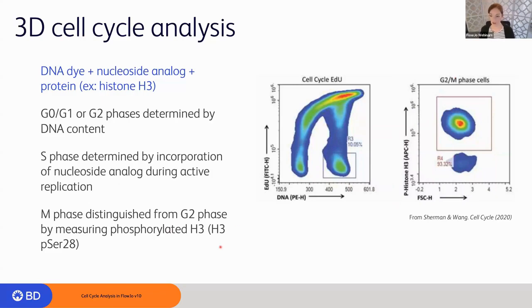So by including that third variable, we're able to decouple and be more discrete about identifying those different stages. And again, there can be variations on this assay. Some will use, for instance, Ki67, which helps us identify cells that are more in the resting phase, or different cyclin combinations that tell us more specific phases of the mitotic cycle. But this is just one of the more popular ones I've seen in the literature, so I thought it was worth discussing.